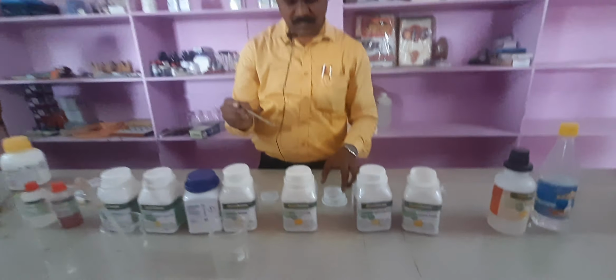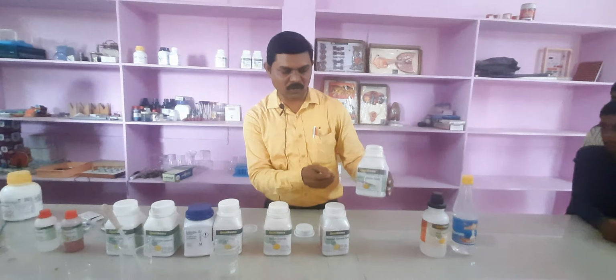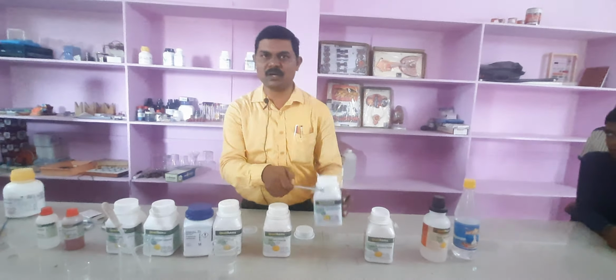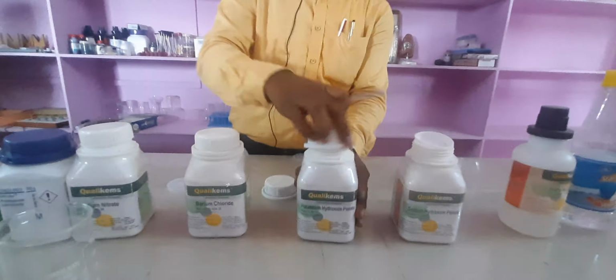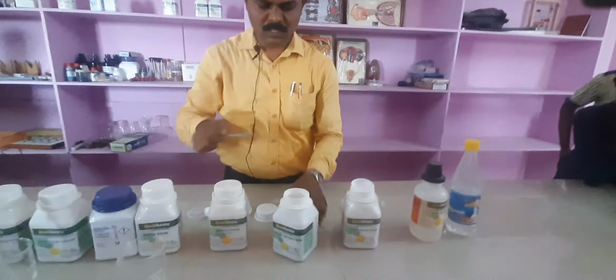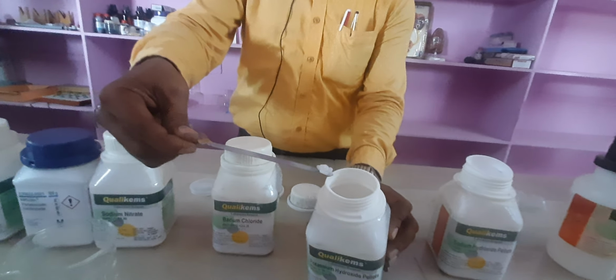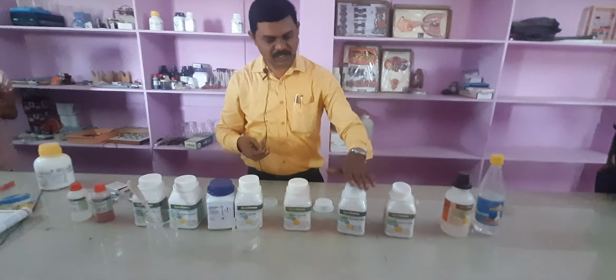Previously we have seen sodium hydroxide only as the formula NaOH in the textbook. And this is another basic substance, potassium hydroxide, KOH. This is also just like pellets, crystals. These potassium hydroxide crystals are also white. So these two are the basic substances.